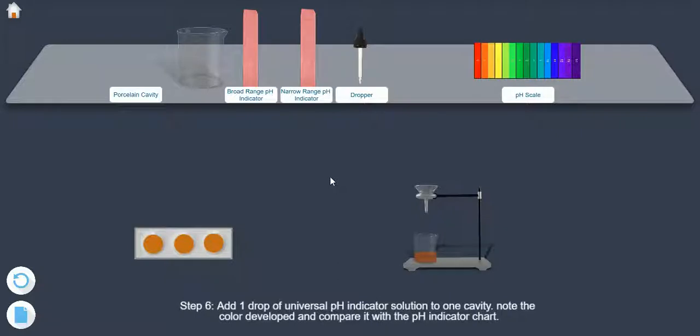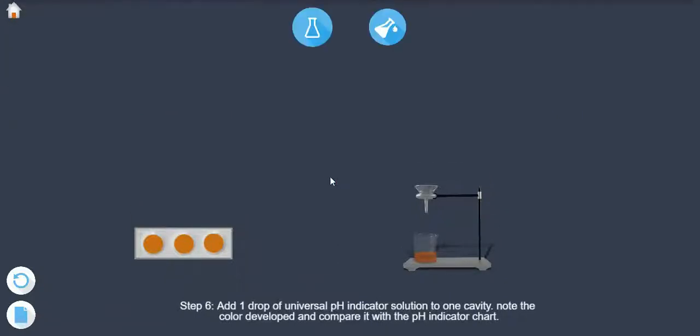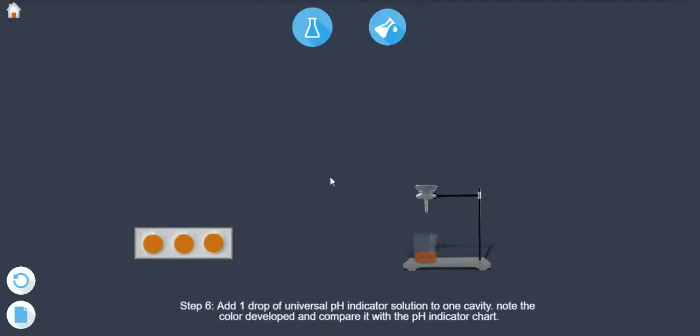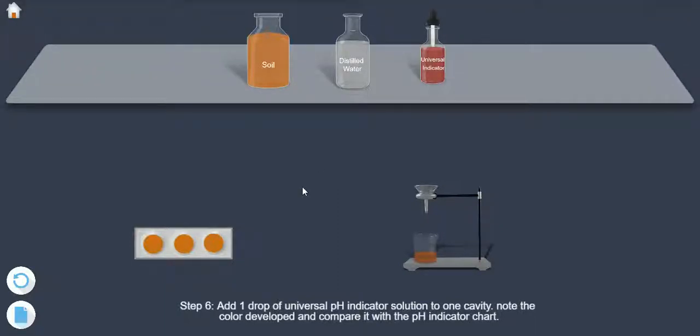Step 6: Add 1 drop of universal pH indicator solution to 1 cavity. Note the color developed and compare it with a pH indicator chart.